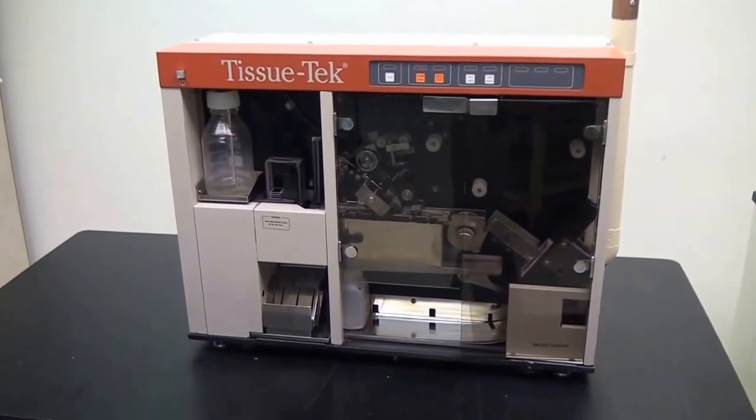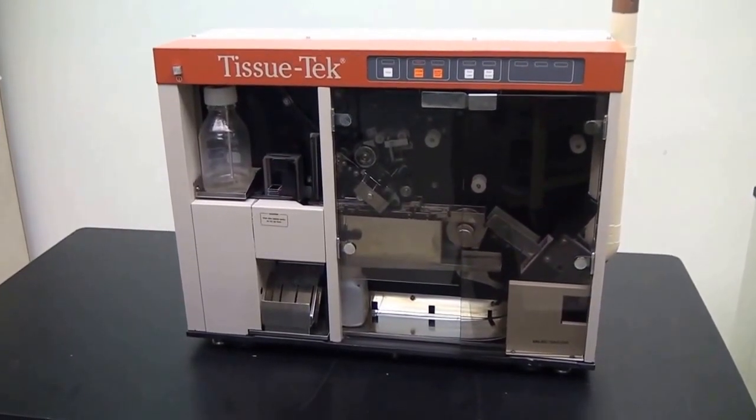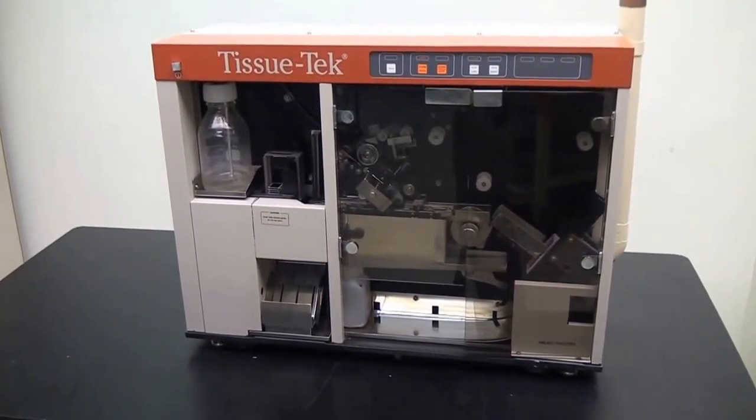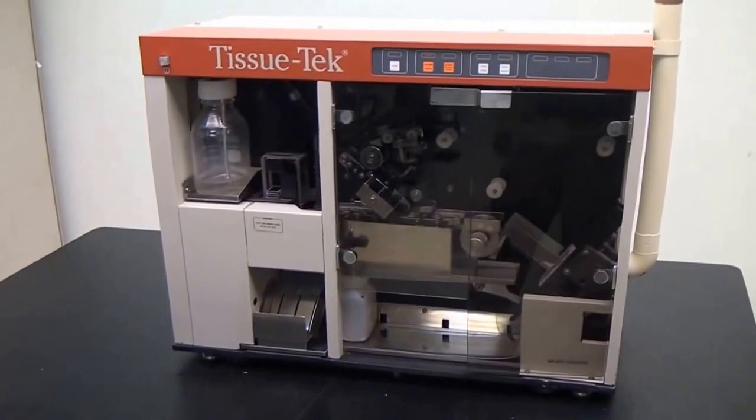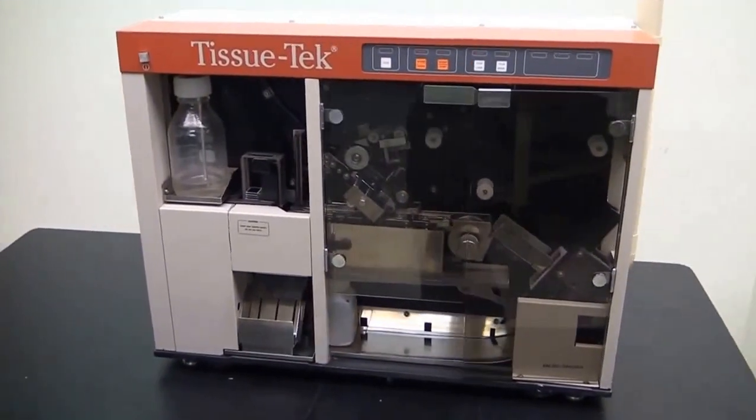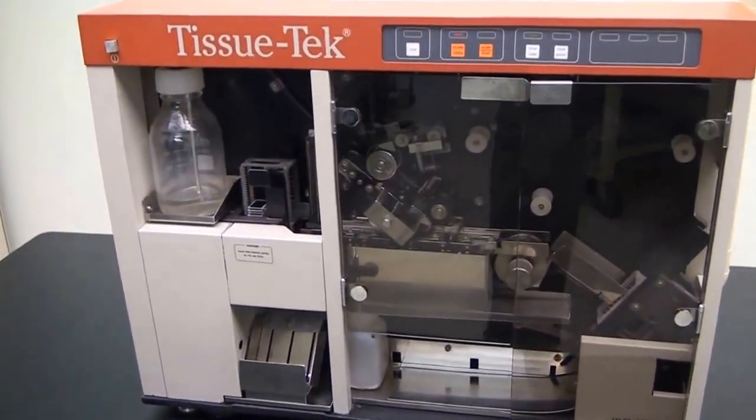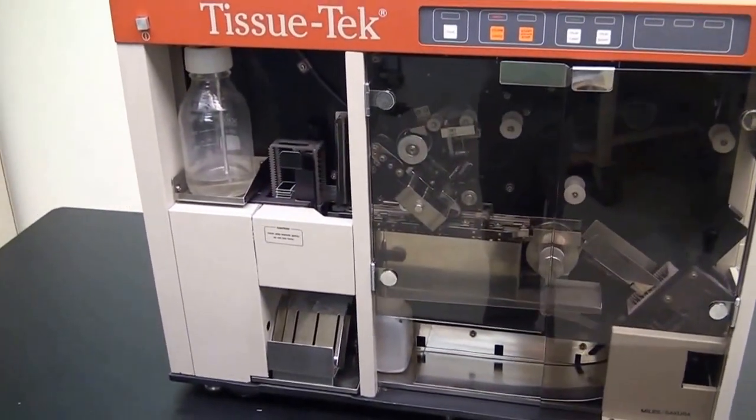We got this unit in and as usual these normally have a lot of wax buildup, so we thoroughly cleaned it like we do all our tissue processors. We did find some things that we had to fix on it in our tech shop.